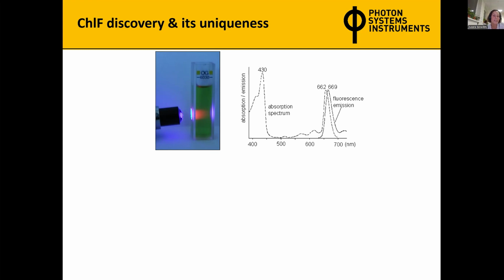And in the image on the right, in the image of the spectra, you might see also the fluorescence emission, which is at longer wavelengths, but it's in red. So for this experiment, if you use red light, you will not see it. Your eye can hardly distinguish the red from a little bit deeper red. So emission is from 670 to 780. Again, it depends on what you measure, if it is an extract or a whole leaf.